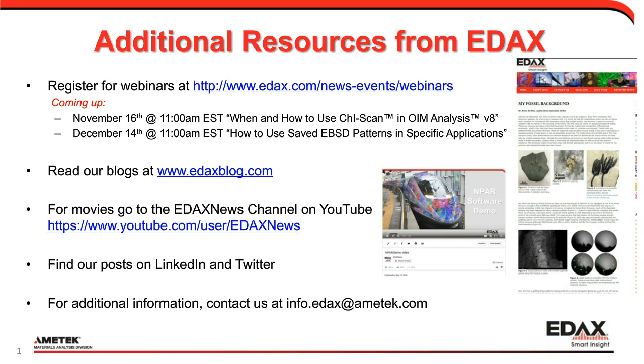Oh, great question. What about sample prep? Does it vary from routine preparation? This question brings back really challenging times for me as a biological student in undergrad, where I prepared a TEM sample based on having to dry it out and mount in wax and microtome, which is very, very challenging. And nowadays, fortunately, things are a lot easier because we have variable pressure microscopes available to us.